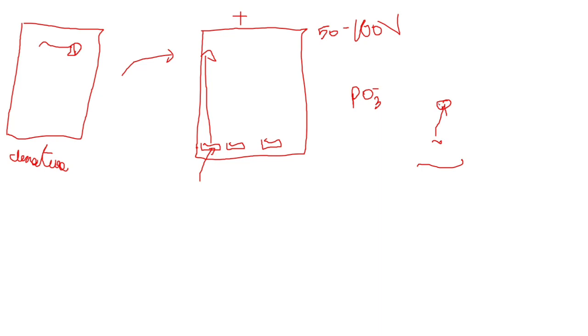So the speed at which the RNA fragments move will differ, and as a result the distance moved also varies. Smaller fragments will be seen over here, and as the size increases, they will be seen more towards this side.